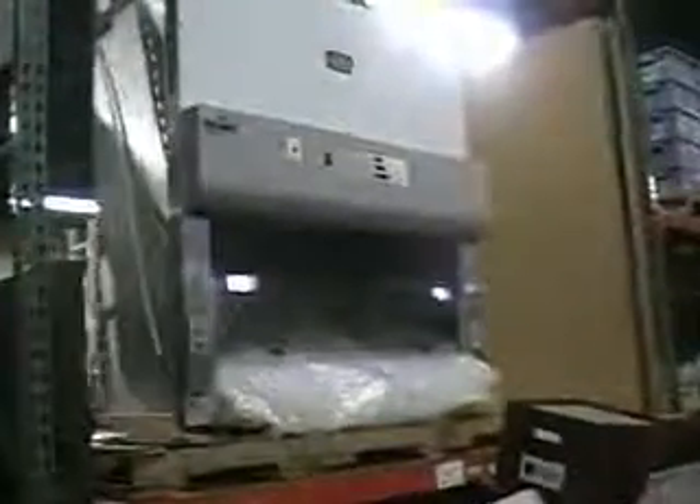Hello, this is Michael Nathau from Hitech Trader. This is the Newair Class 2 Type B2 Biological Safety Cabinet.